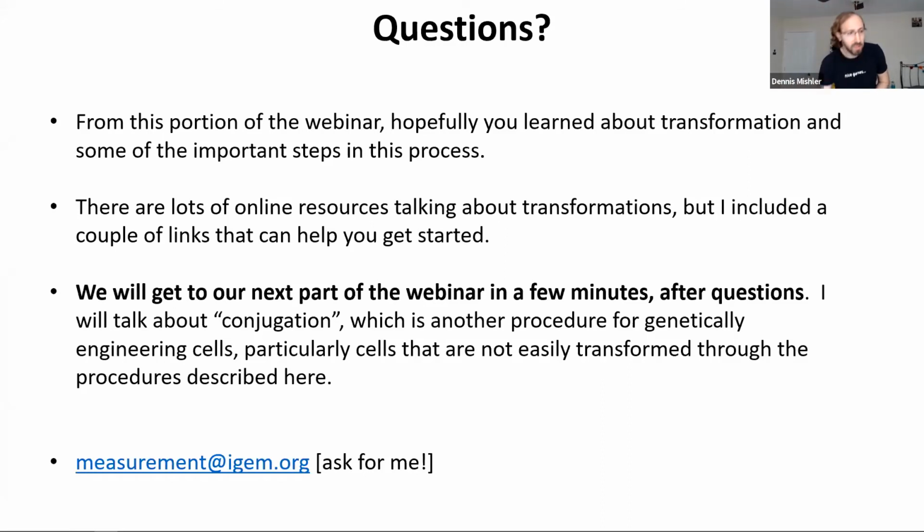Okay. So there's a question here from Aparna. What can be the industrial application of transformation at very large scale? Well, let's say you're in industry and you want to create some new product. You've got to genetically modify your organism. So you can either engineer the chromosome, or you could make a plasmid and then transform that plasmid into your cells. So I think that's one possibility.